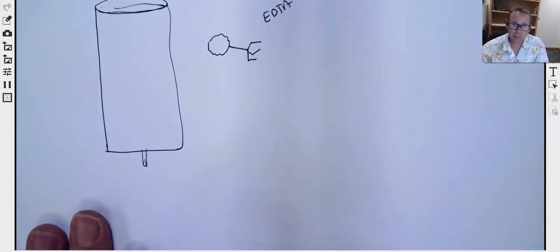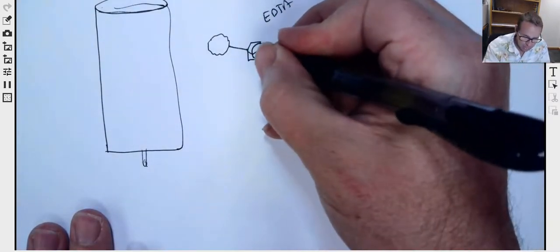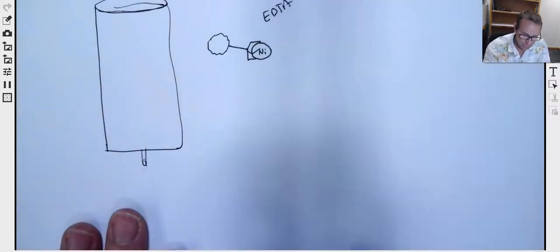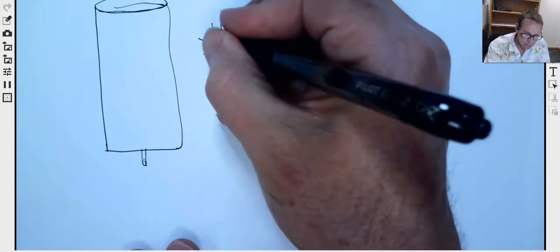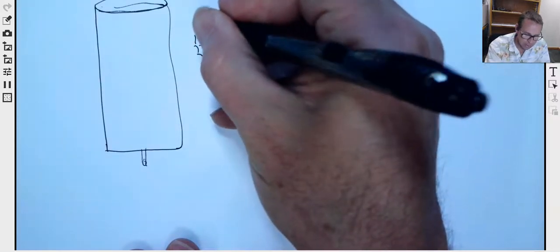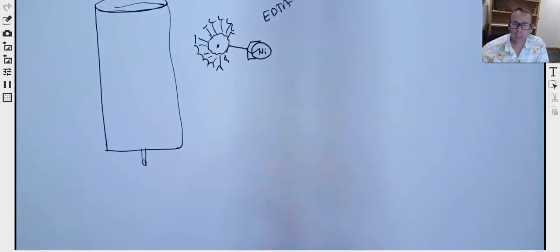And when the nickel resin is charged, what it means is it has an atom, an ion of nickel bound to that EDTA moiety. This resin has hundreds of thousands of EDTA molecules on the outside like this, right? Okay.